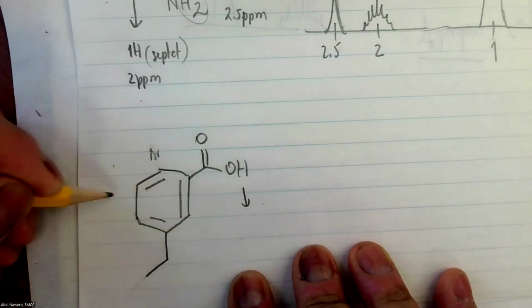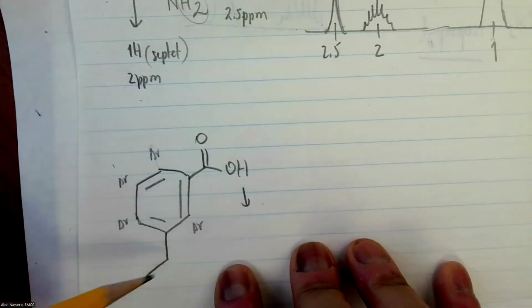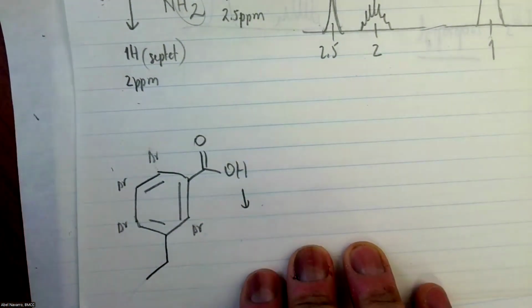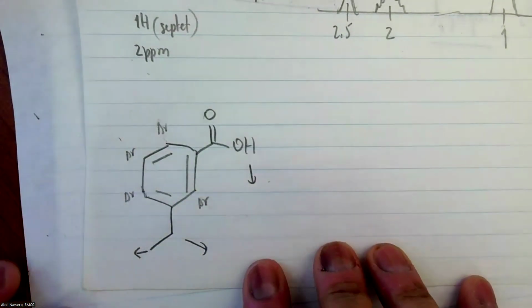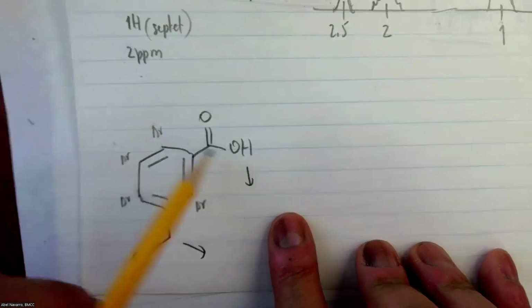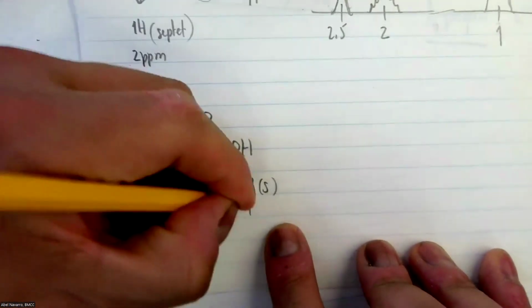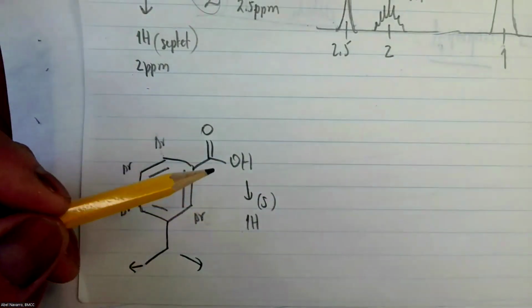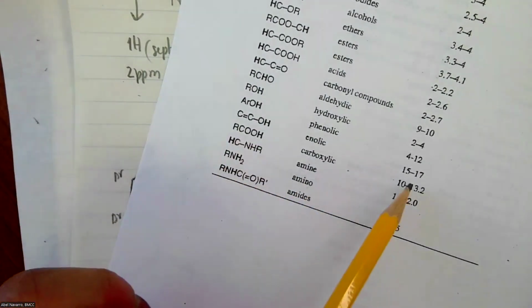Okay, aromatic, aromatic, aromatic, aromatic, if they have this type of distribution. This one is another one, and this is another one. This one is a singlet, right? Because there is no neighbor, and it also goes through hydrogen, so singlet. 1H, and for the ppm, this one is a carboxyl group. Carboxyl groups are between 10 and 13.2, so let's do it at 12 ppm.